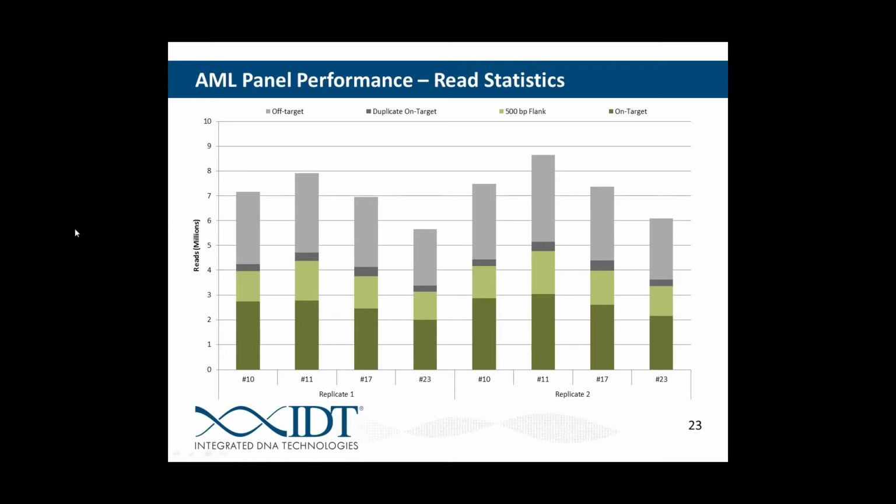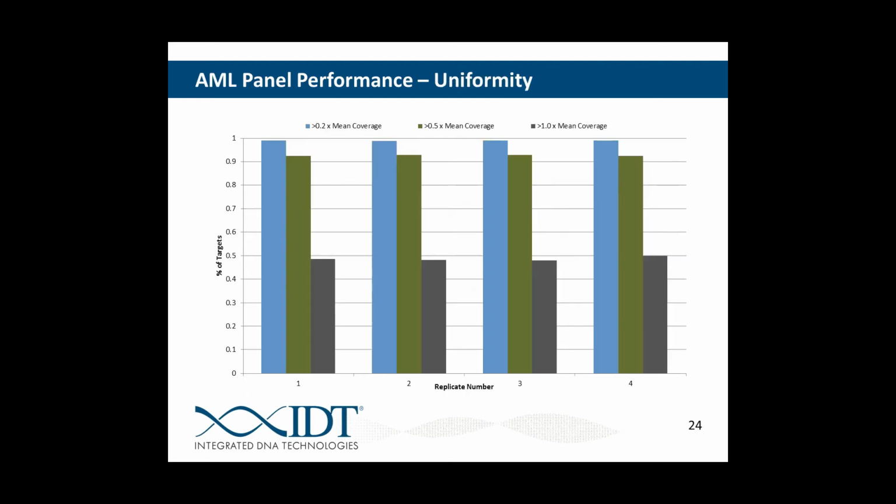And these also are numbers with 4 samples barcoded in. So in other words, these are 4 samples put in together that you're getting 2 million reads of. And you have the potential to even barcode further if you don't need as high depth coverage.